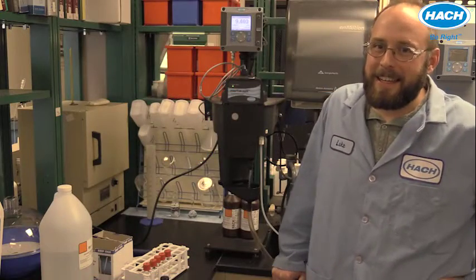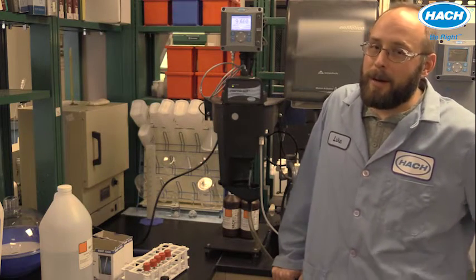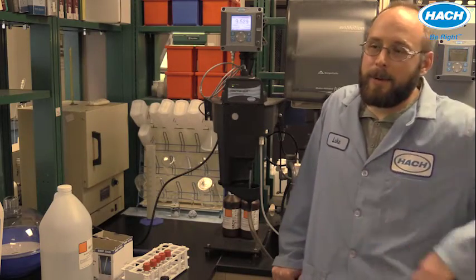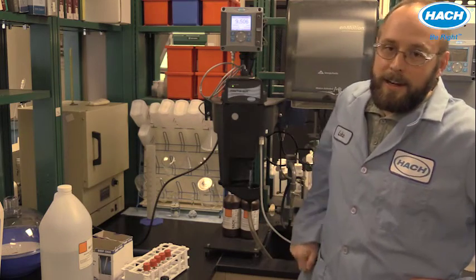Hi, this is Luke Johnson again, and in this video I'm going to be discussing how we can monitor iron corrosion with a turbidimeter and how we can calibrate the turbidimetric data with total iron data.